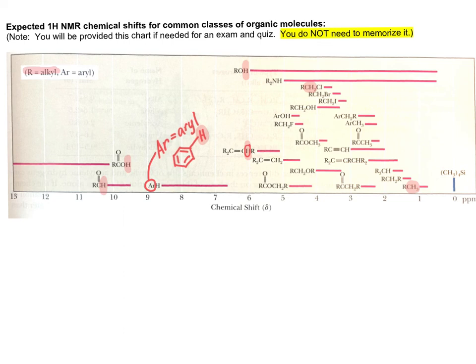point of interpreting NMR data, because it will allow you to take an NMR spectrum and look at a particular chemical shift value that you are seeing. And when you see that particular chemical shift value, you'll be able to look at this chart and go, okay, what are the hypothesized functional groups that may correspond to that chemical shift at a particular ppm range? So for example, if you saw a chemical shift at 5.5 ppm in your spectrum, you could look right here at 5.5 and go, okay, I hypothesize there is an alkene group in the molecule, with that proton being the one that's directly bonded to the alkene, or maybe a hydroxy group, and we're looking at the proton from that hydroxy group, to make hypotheses about the groups that you see within a molecule.